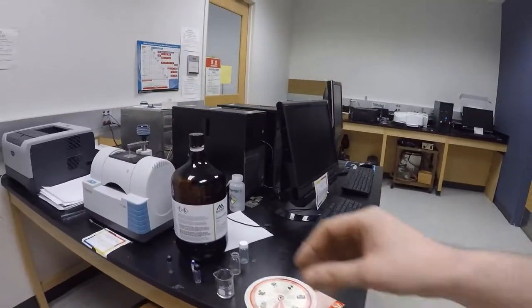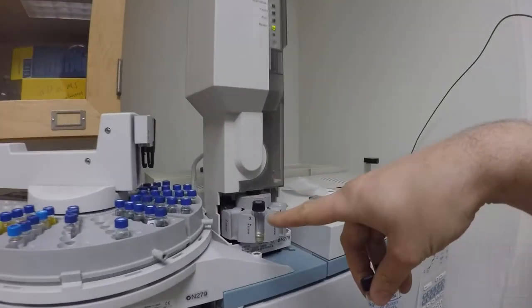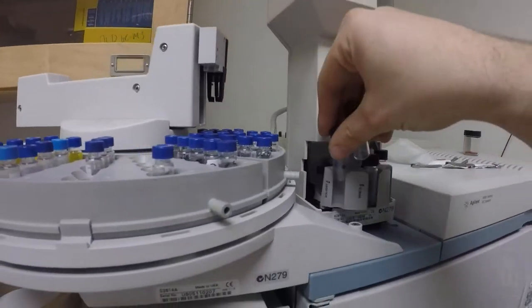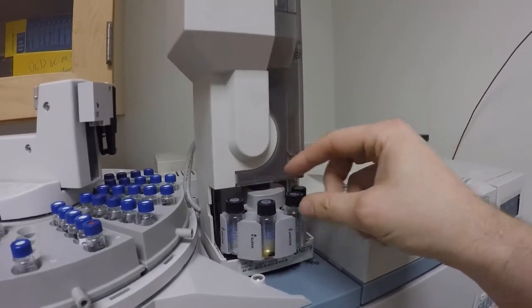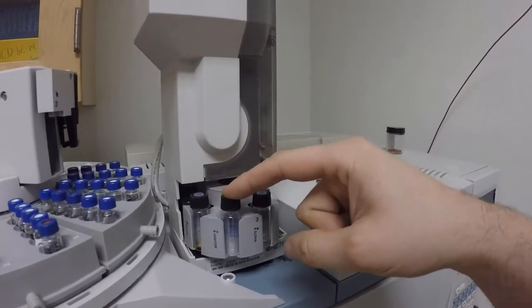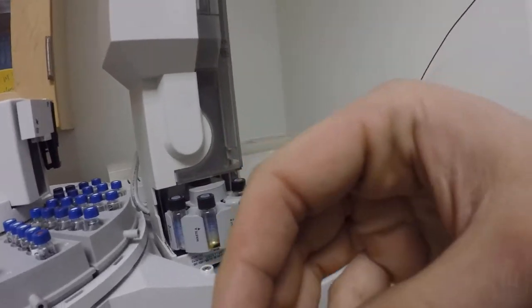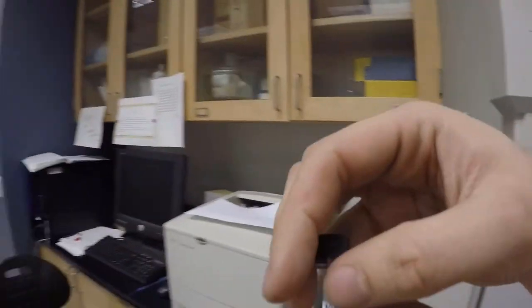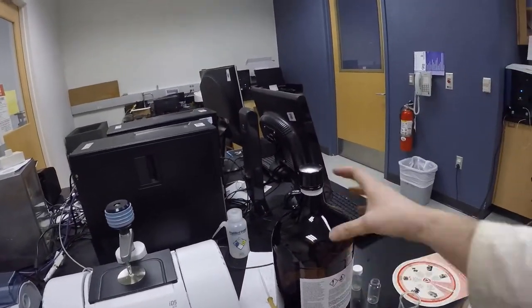Now in the meanwhile, we have a couple of these little solvent vials that usually will be sitting right here in the solvent A and solvent B slots. Every time you do this, you need to make sure that solvent A is hexane and solvent B is methanol. And we can do that over by the hood. So I'm going to grab these out. It doesn't matter which one is which. For now, I'm just going to make a little space for us to do this.